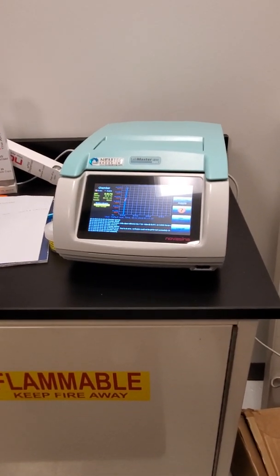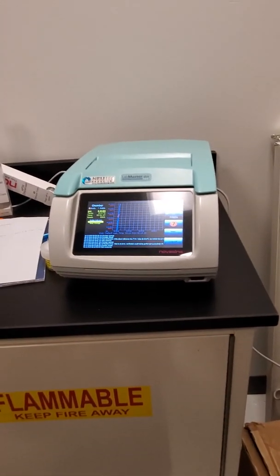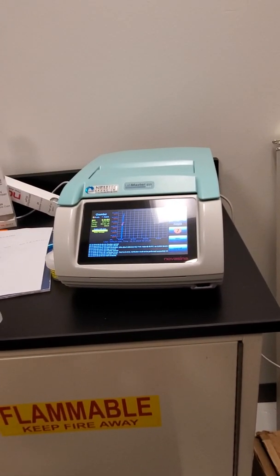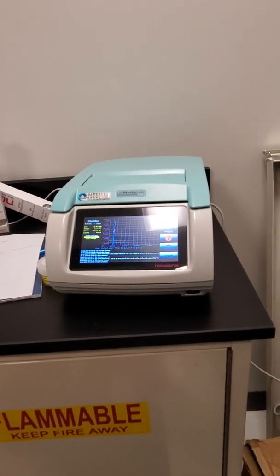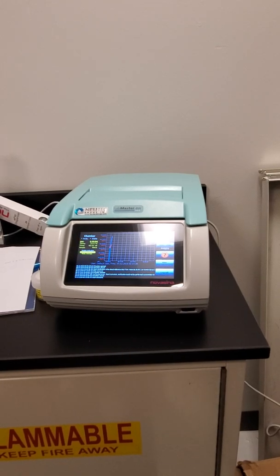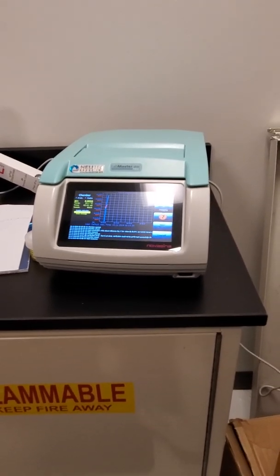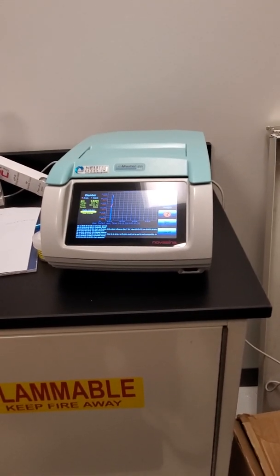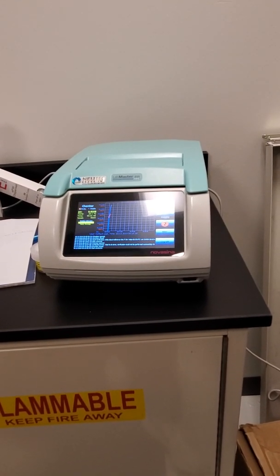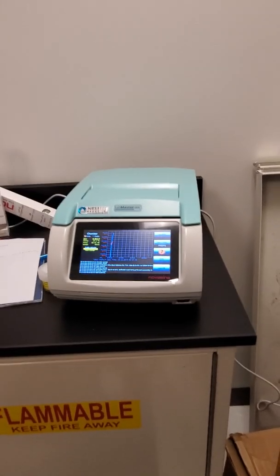Well, and then just walk away, come back 40 minutes. It doesn't change the accuracy of it. No. The only way it changes is if you actually take the value off of fast that's not the right value. So in that sense, it is the same as long as you keep it closed. But if somebody's running on fast, it beeps, they record the value and lift it up and run the next one, you don't know whether or not it actually achieved it.